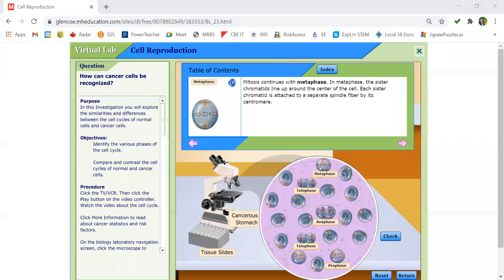Now we have an image of a cell from cancerous stomach tissue. I've labeled some cells as prophase, telophase, anaphase, and metaphase. The chromosomes in metaphase are lined up in the middle. In anaphase, the chromosomes are starting to move towards the opposite end. In telophase, the chromosomes have finally moved to the opposite end.